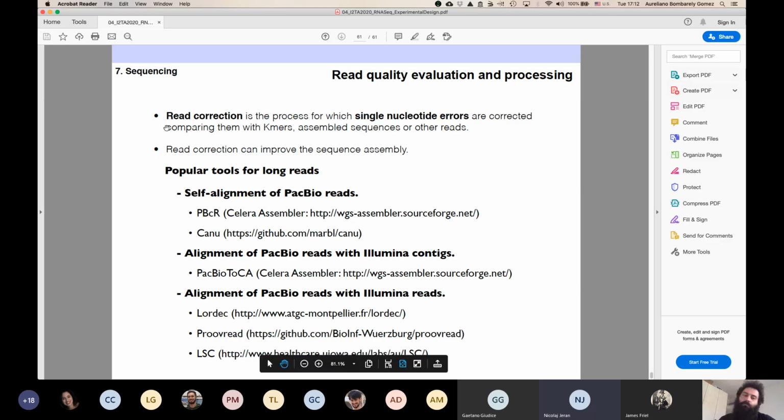Actually, I have a question about the sample preparation after the RNA extraction. Of course, you have to do reverse transcription, and you can use either random primers or oligo-dT. But are there any differences? I mean, the random primers should cover everything. Yes. The problem with the random primers is very simple.